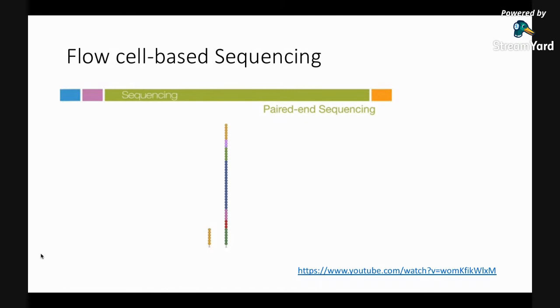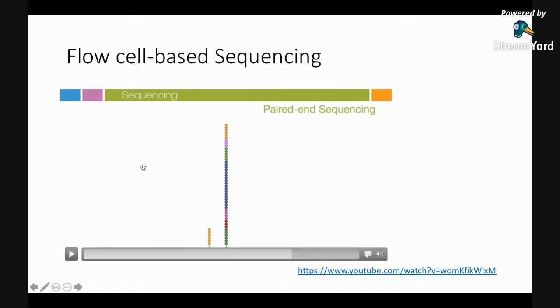In paired-end sequencing, you make this bridge, and then you sequence again, but this time you sequence the other side of the cDNA. So in paired end, you get both sides of the cDNA that were ligated with adapters. This is the difference between single end and paired end. Single-end sequencing does not mean that you cannot do dual indexing. You can do dual indexing with single end. Similarly, you can do single indexing with paired end. If you do not have so many samples, you do not need so many barcodes. But the more barcodes, the more samples you can sequence together. I hope that makes sense.